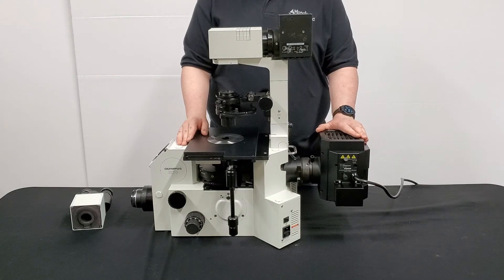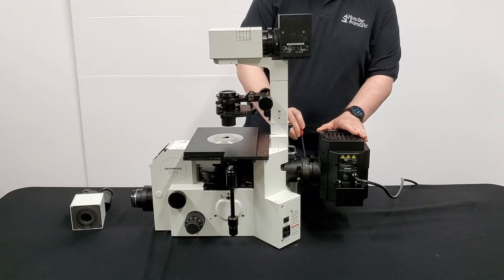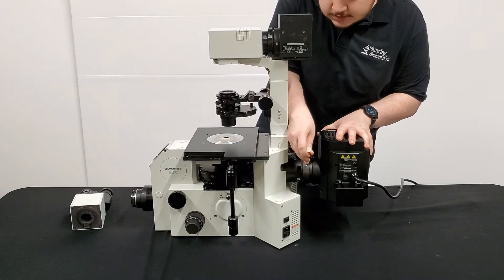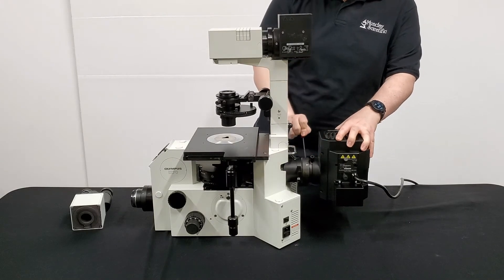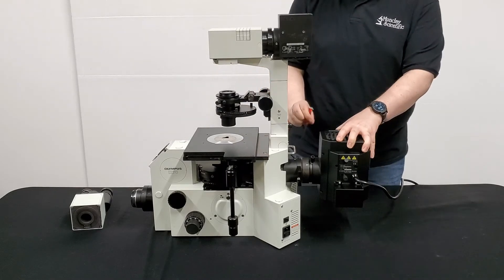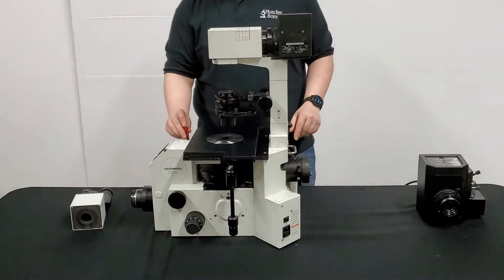Now we're removing the rear lamp house right here. Go ahead and get your 3mm wrench again. You're going to want to locate these two screws — they're both on the side adjacent to each other. Slip your wrench in and loosen them a few turns each. Again, support the lamp house so it doesn't fall. You'll feel it start to give a little bit once you loosen the second screw. Then you just slide it out and set it to the side, once again replacing your 3mm wrench.